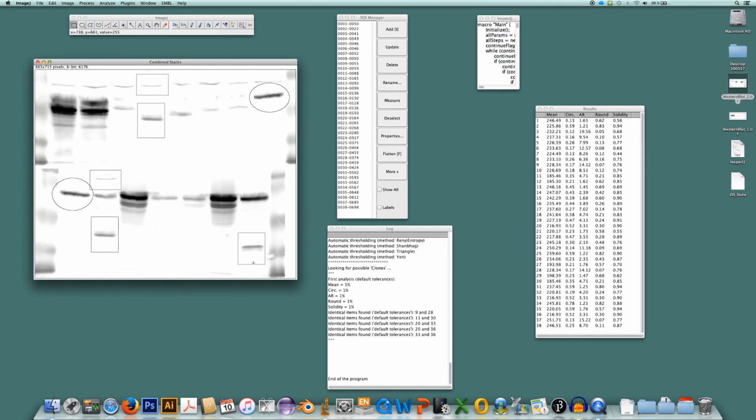So the software has easily found clones between or across images. So most likely this object was copy pasted here. This object was simply copy pasted and flipped horizontally here. And this object was copy and pasted here and copy and pasted and flipped vertically here. Okay, I hope I could convince you how easy it is to identify clones across images with InspectJ.